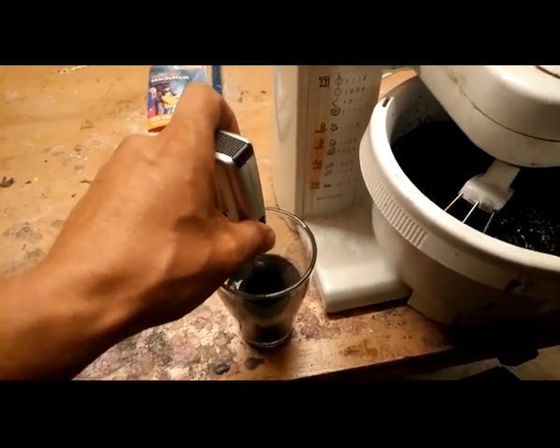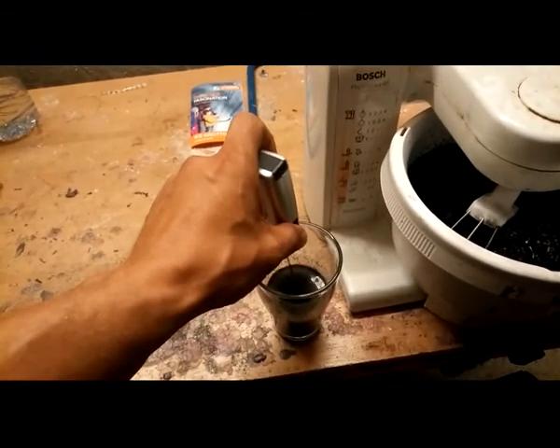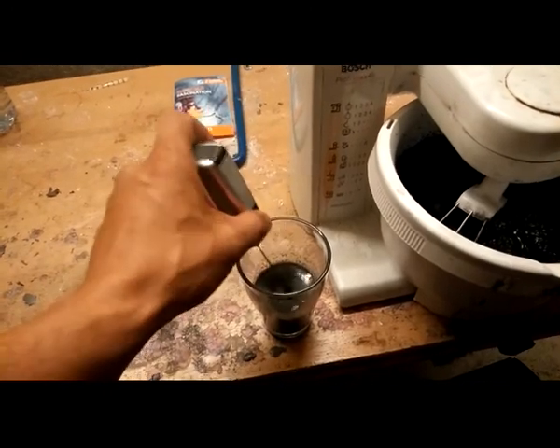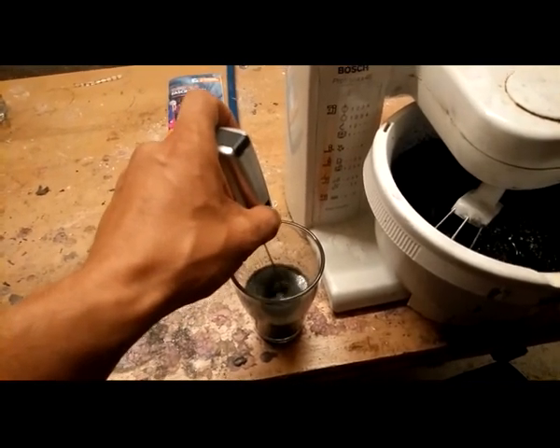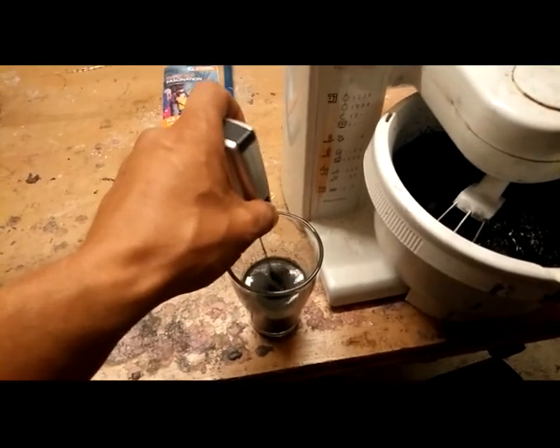When it's well mixed, I leave it for some hours and let's have a look what happens. Of course, do it on a warm place.